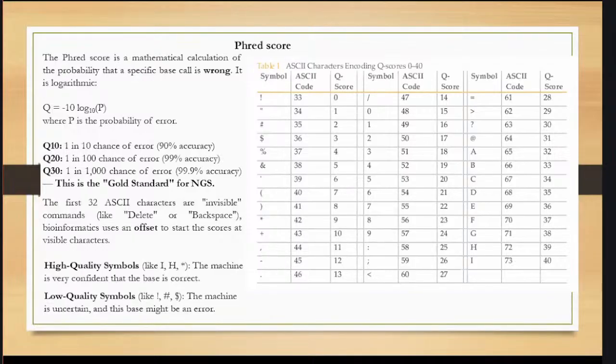So in the read sequences, FASTQ is showing you the quality scores by using all these symbols, showing you whether you have to take the read forward or remove those reads. Normally, a Q score of 30 is used. It's a gold standard in NGS that you have to use a 30 score.